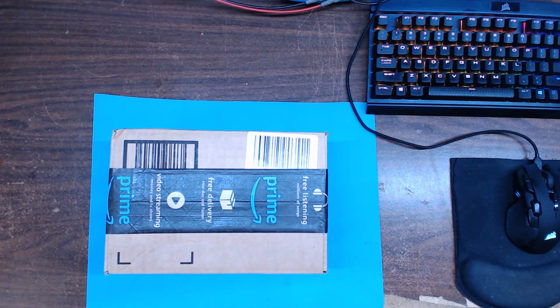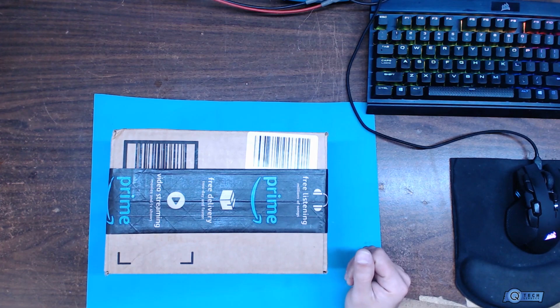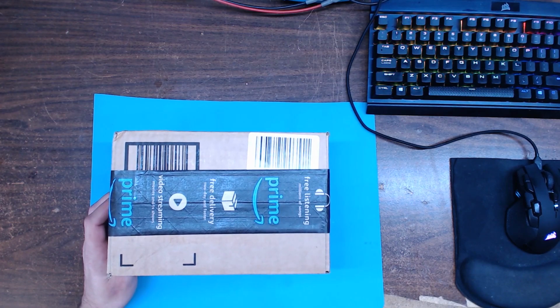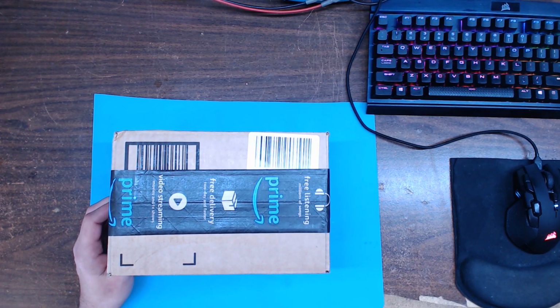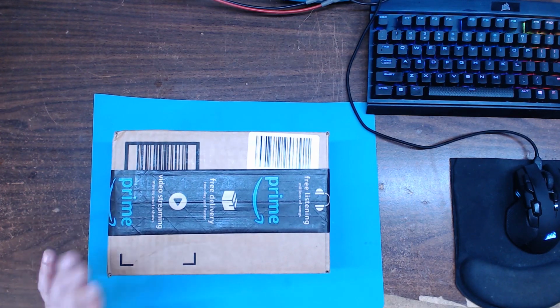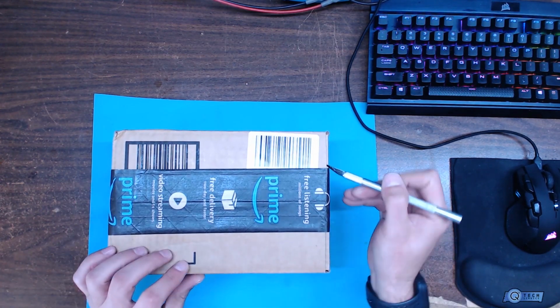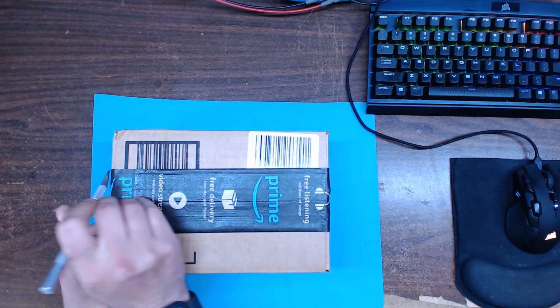So I've seen there's other microscopes that range out to like $500 to $600 from Amscope, and to find out what sensors they're using, the good sensors are going to be the Sony sensors. I looked at a lot of other people's videos. Let's say Paul Daniels, I check out his channel, and he's got a pretty clear picture. So he's got the Sony sensor. I know that camera roughly sells for about $450. So this is supposed to have the same sensor for less than $100. So I'm kind of curious to see how it's going to perform. It's going to be kind of interesting, to tell you the truth.